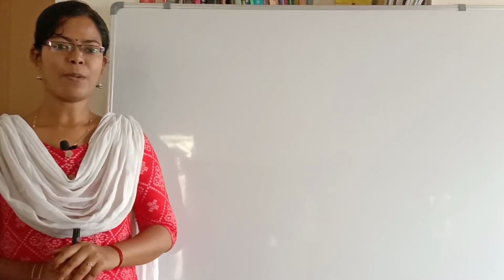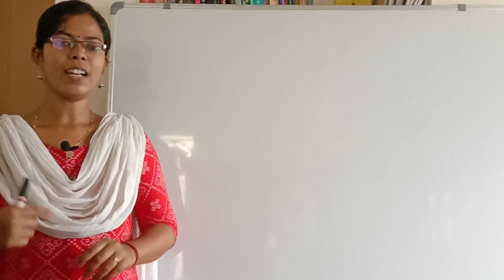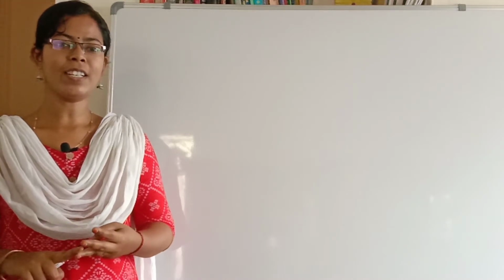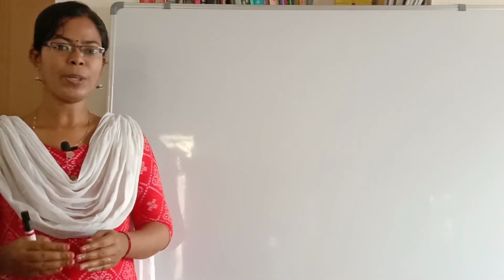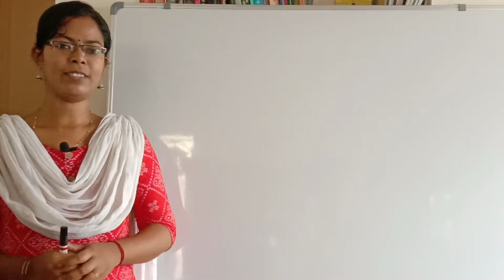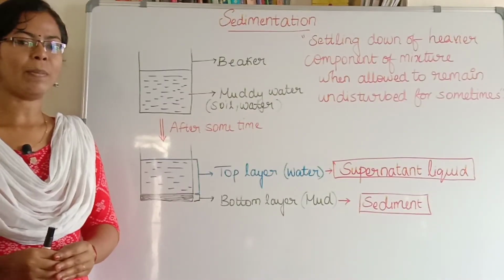Hi students, welcome all. Today we are going to see another separation method, sedimentation, decantation, filtration through an experiment which I am going to explain now, and also we are going to see about food adulteration. Now let me start explaining the experiment.